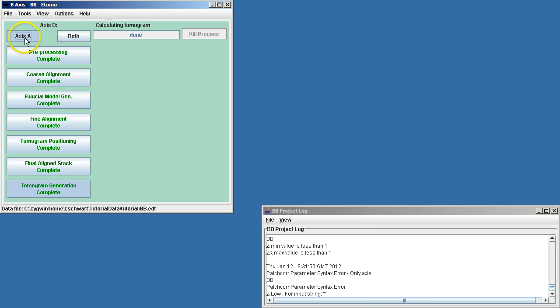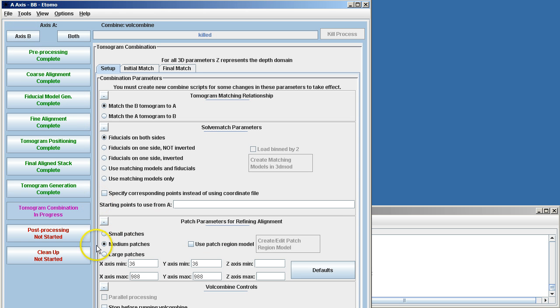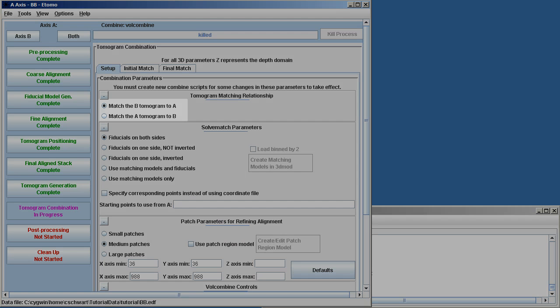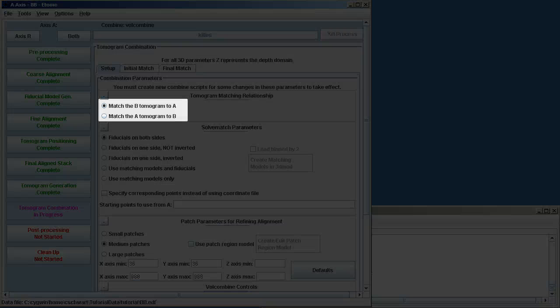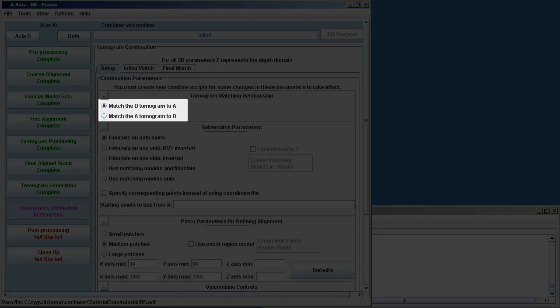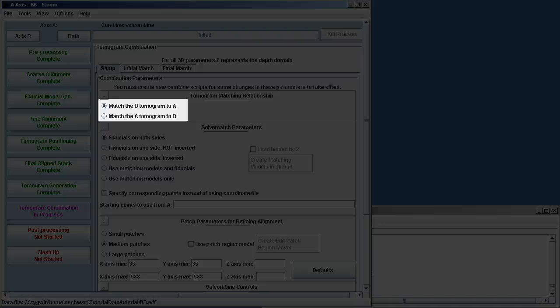So here we need to go back to the A-axis. We are in tomogram combination, and there are a few steps we have to set up. First, we have to know that we want to match the B tomogram to the A tomogram. This is almost always the case.